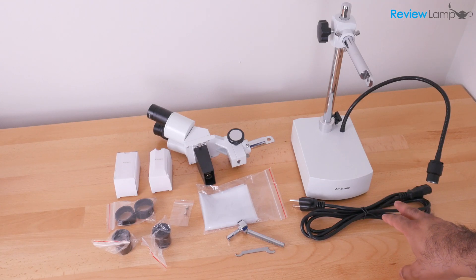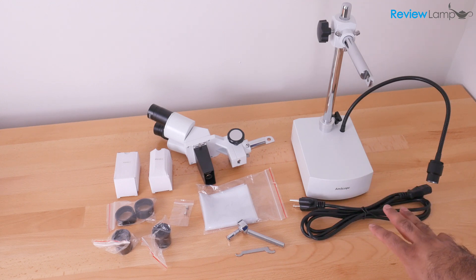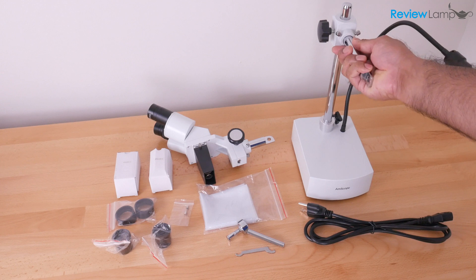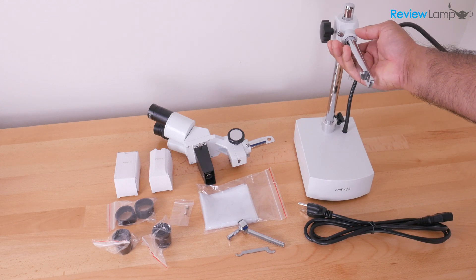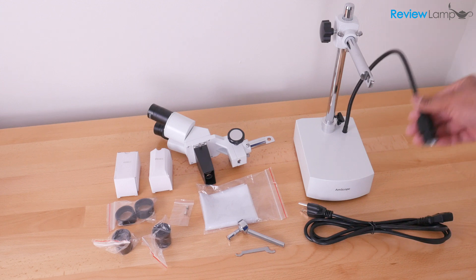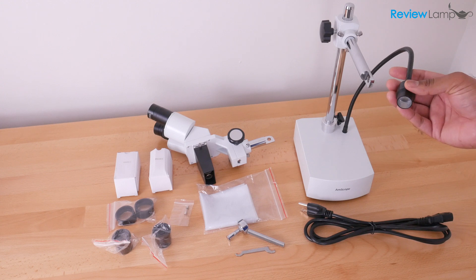So let's see what we get with the unit. I've taken all the parts out of the box. You have the power cable, very important. You have the microscope's base itself, which is a pretty heavy base, and this already comes pre-assembled. I didn't do any assembly on it. It has the gooseneck light on it, which we're going to need to illuminate the subject.